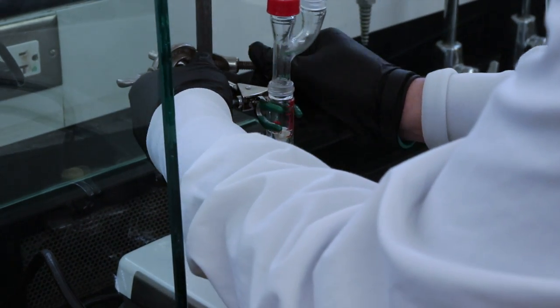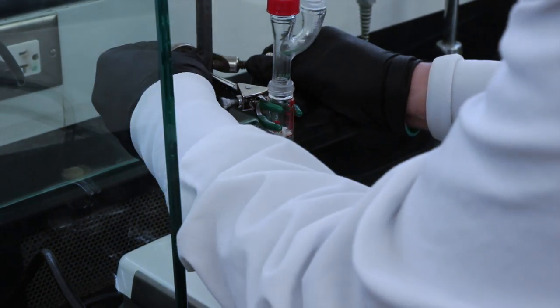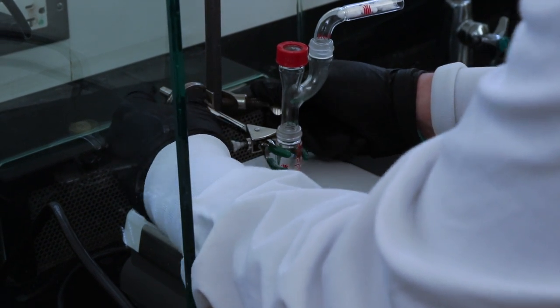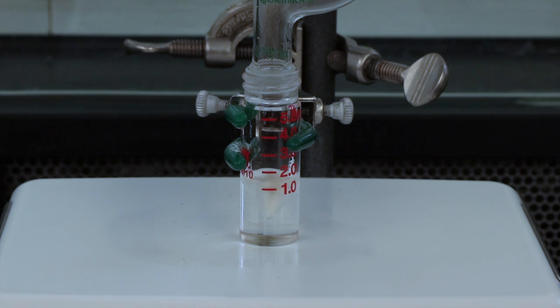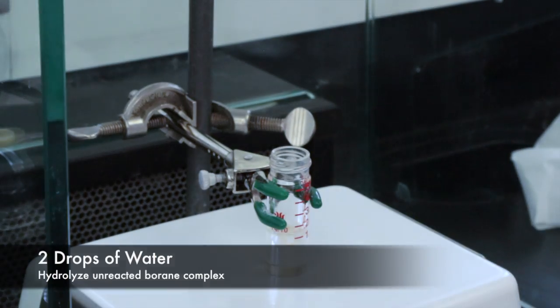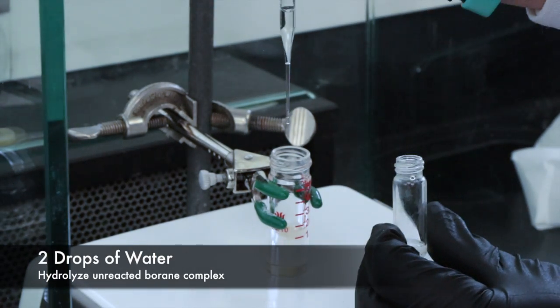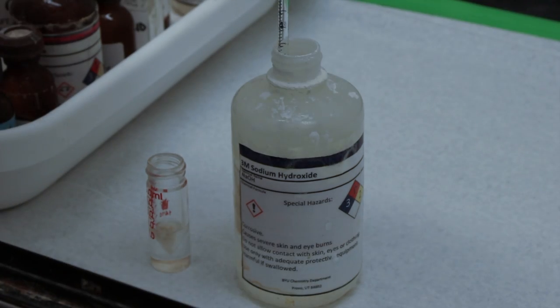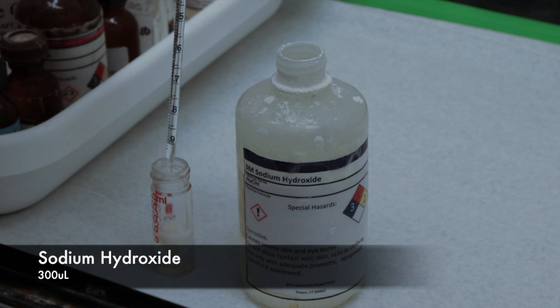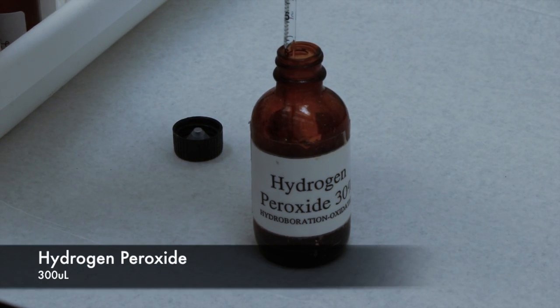Once everything has been added, I can now take the conical vial out of the ice bath and let the reagents react together for about 45 minutes at room temperature. Once that is done, I'll add 2 drops of water to hydrolyze any unreacted boron and stop the reaction. Now we can move on to the oxidation step of this reaction. So I'll be adding the sodium hydroxide and the hydrogen peroxide.